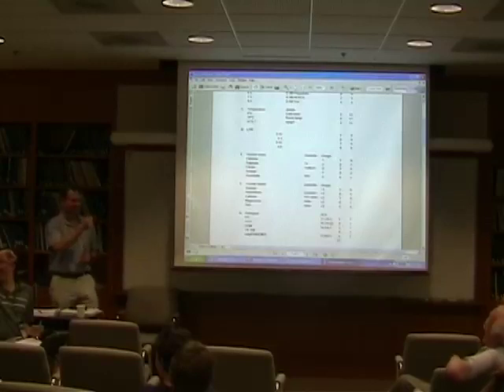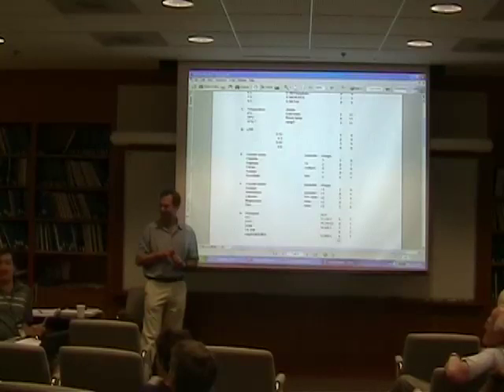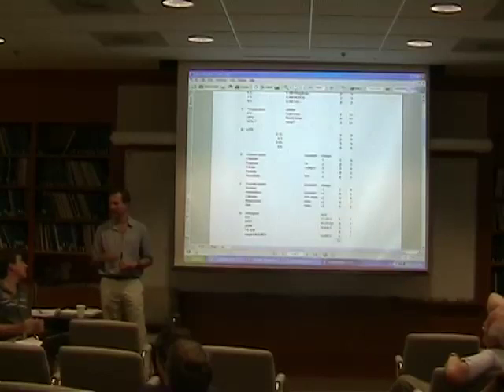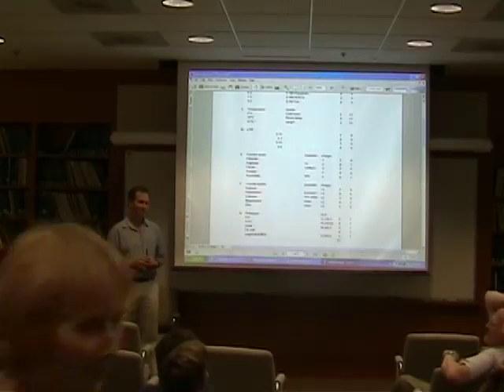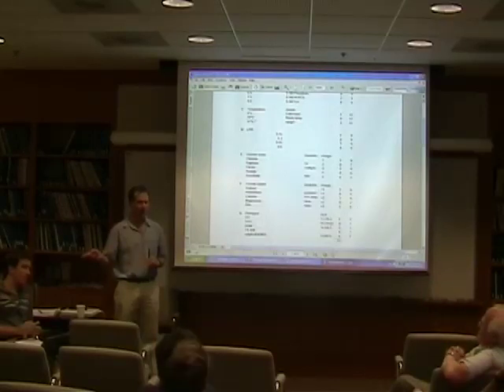That's actually based on statistics and analysis from the papers that we publish as well, to a large extent, those conditions there. So Michael went through those hundreds of papers and pulled out the best conditions. It would be interesting to mine the literature. Maybe some people already have a pretty good idea, but to see, of the things that did give some kind of crystal, how much overlap is there with these parameters and these choices? That's what it's based on.